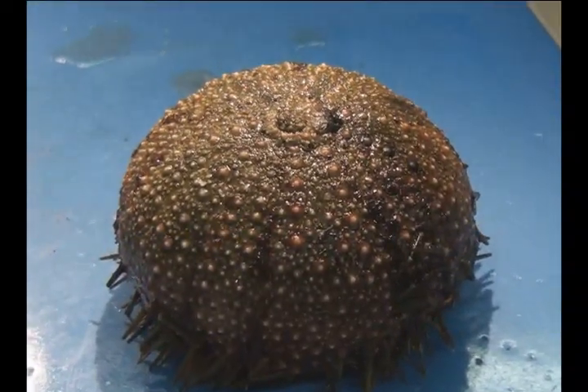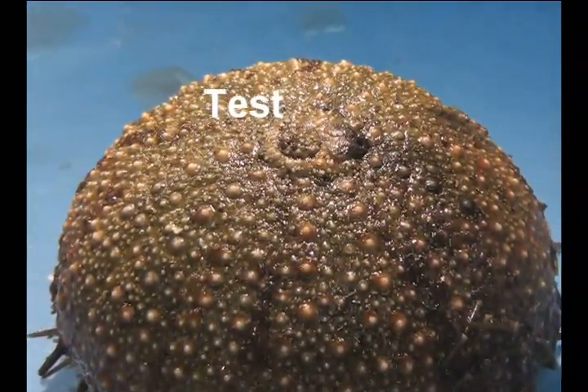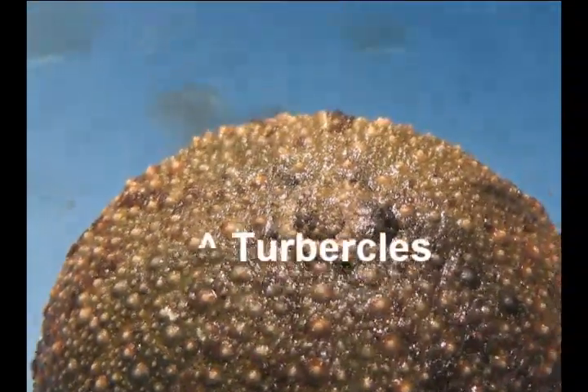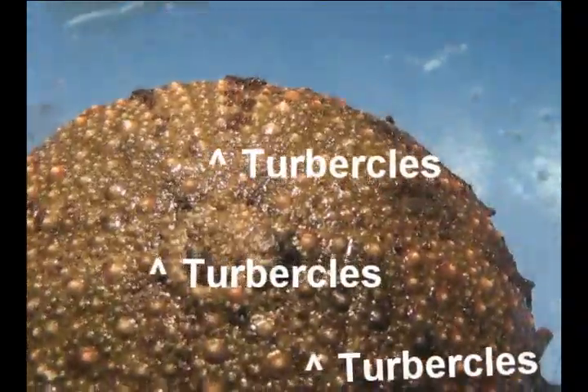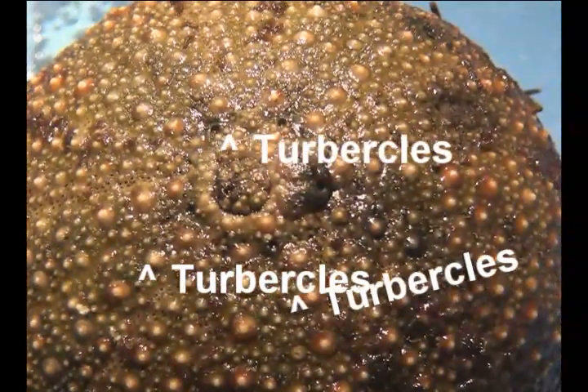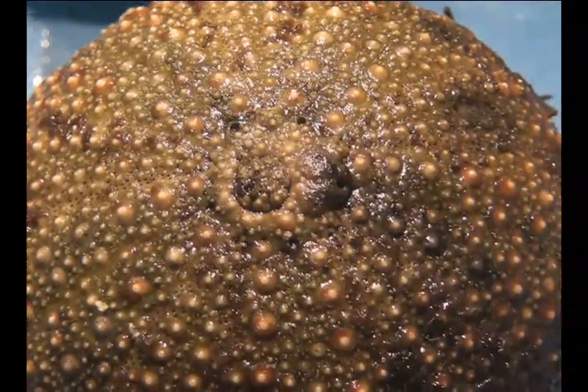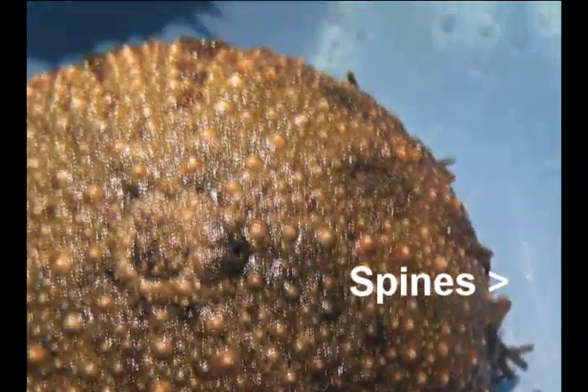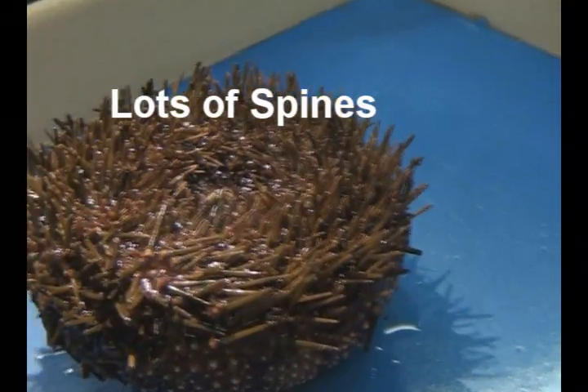Now the outer shell of the sea urchin is known as a test. The small white dots on it are known as tubercles. And off to the side, you can see spine-like projections, which are known as spines. This one has a lot of spines.